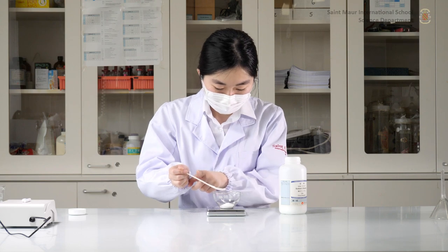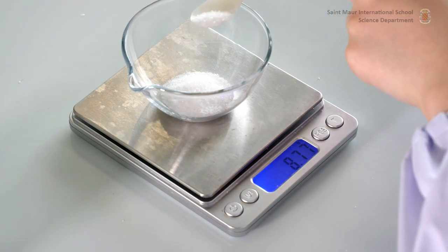When you get close to the desired mass, tap gently the side of the spatula for better control.